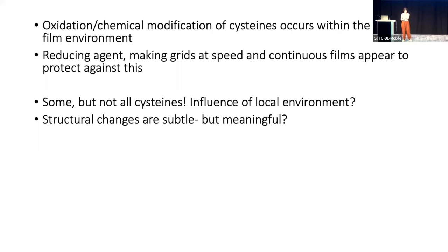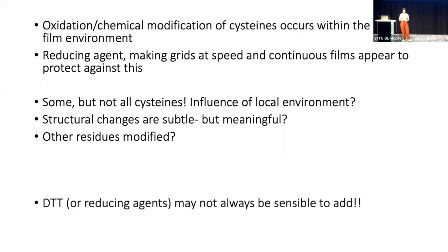So I think we're still at the beginning of fully understanding the implications and looking for more examples of this happening. But I think it is interesting to see this chemistry at the air-water interface impacting the structures that we're solving. Another thing we're not very sure on, again, I'm not a chemist, it may be that we think theoretically there will be other residues, not just cysteines, that are potentially impacted by that. So it'd be interesting to go and see if we can investigate that.